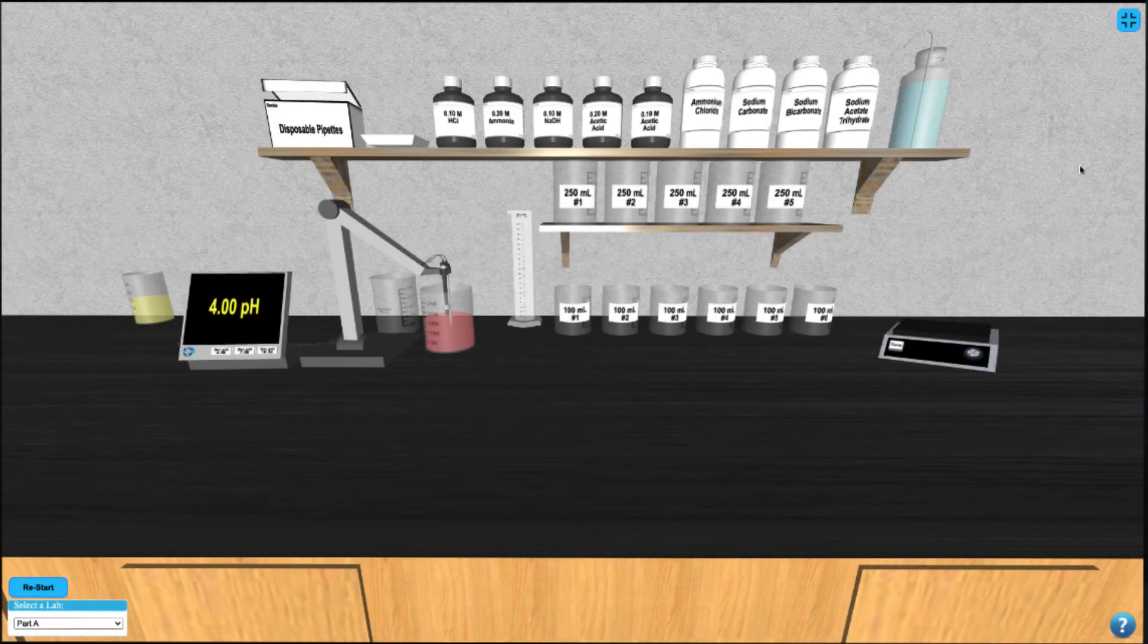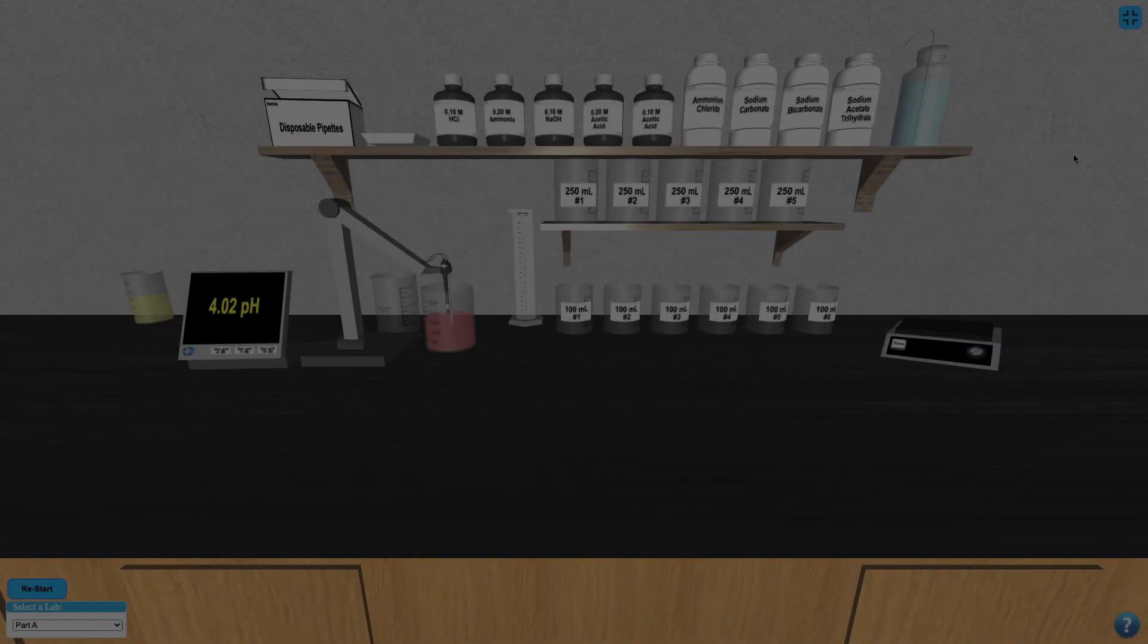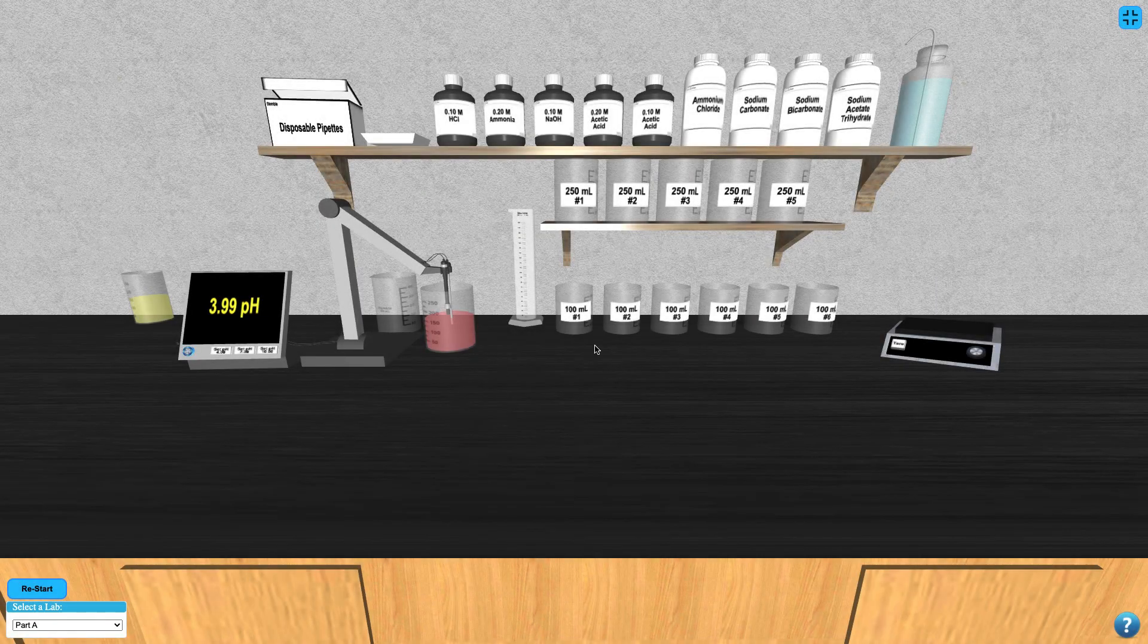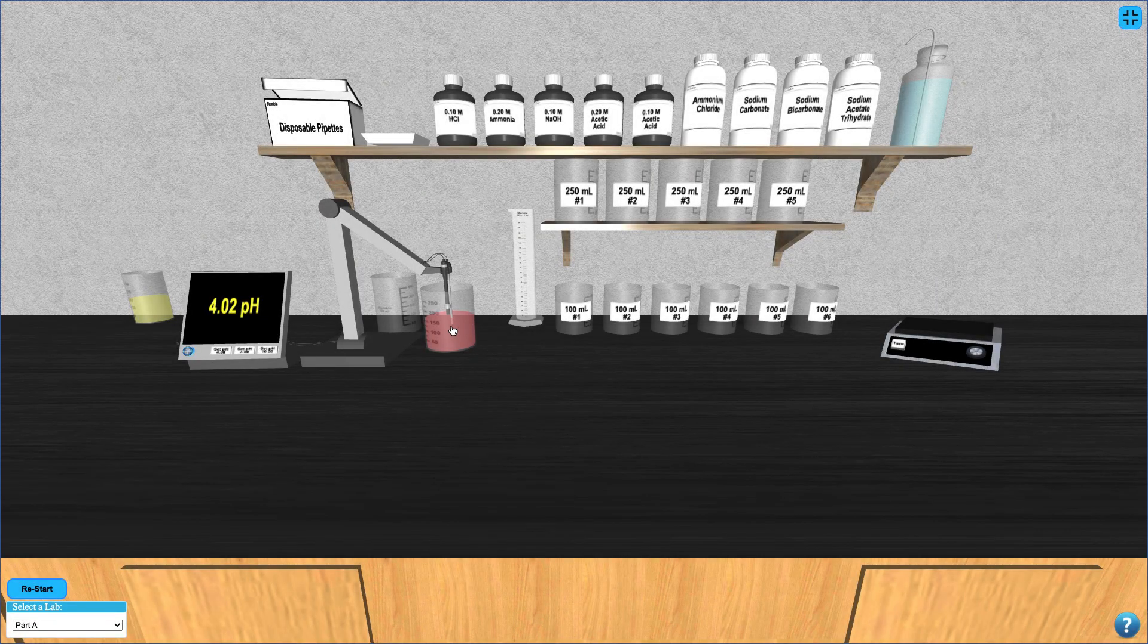To begin part A, you'll create a series of five buffer solutions. The contents of these solutions are available in your lab manual.